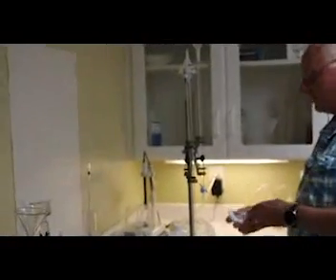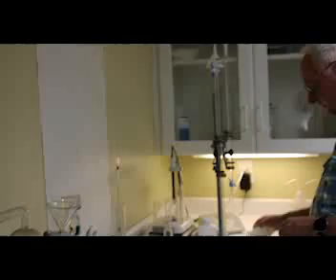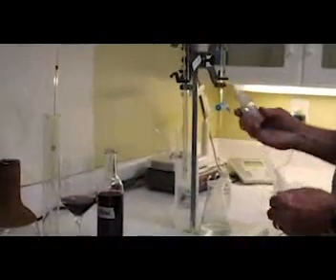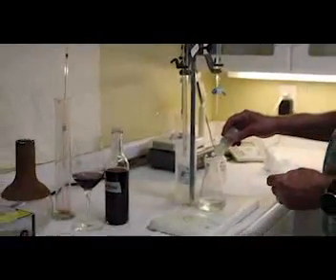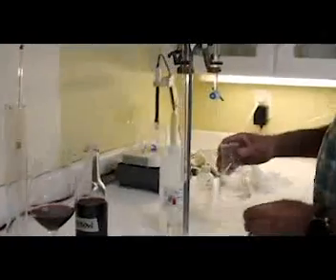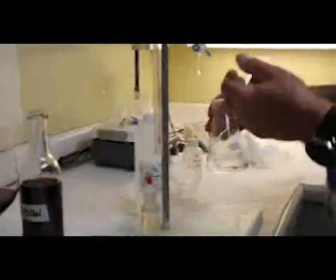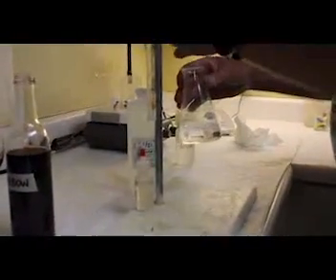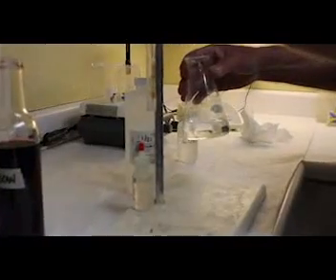So in the meantime, I'm going to run the titration. I just make sure there's no drops on the bottom there. I'm using 0.1 normal sodium hydroxide. You use phenolphthalein as a color indicator, so 3 or 4 drops of that. And then you start swirling. Everybody has their own way to titrate. I swirl with my right hand since I'm right-handed, and I control the petcock with my left hand.